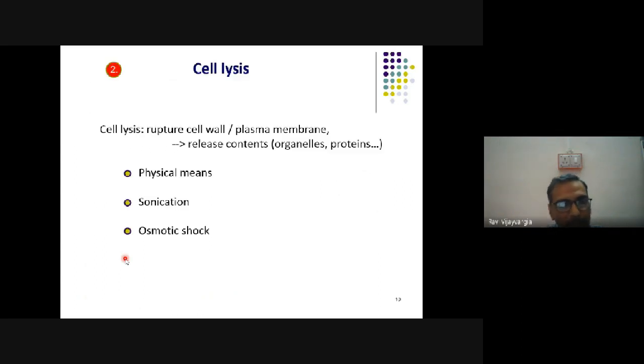Before we purify any protein, we have to get the protein out of the cells where we are expressing it. It can be a bacterial cell, yeast cell, mammalian cell, whatever cells you are using for expression of your protein. You have to get your protein out of it. These are the common methods by which you can release the protein from the cells. You can rupture the cell wall in the case of plants or bacteria, or rupture the plasma membrane in the case of eukaryotic cells. Also, you can use different detergents which will get the protein out of different organelles in the cells.